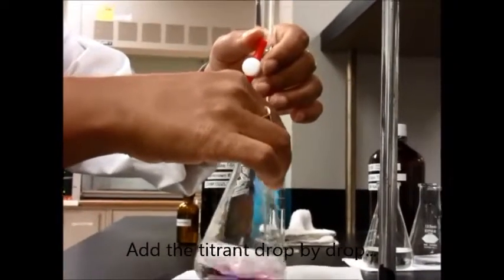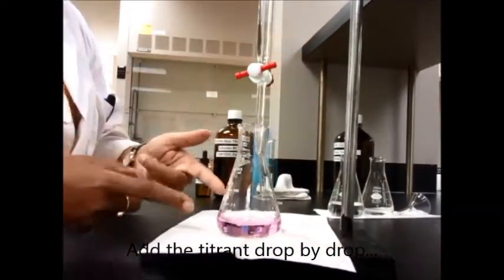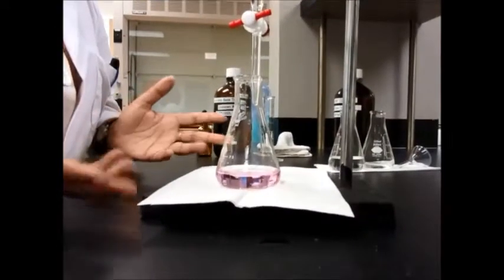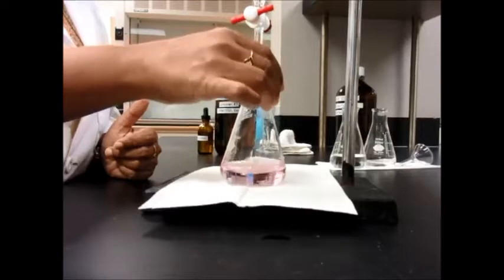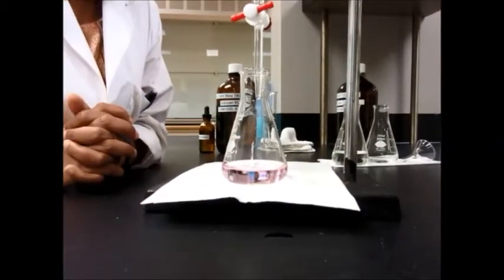If it's turning pink a lot, just stop. The color you need for the endpoint in an acid-base titration should be absolutely very light pink. Then leave it for about 10 to 30 seconds and see what happens to the pink color.